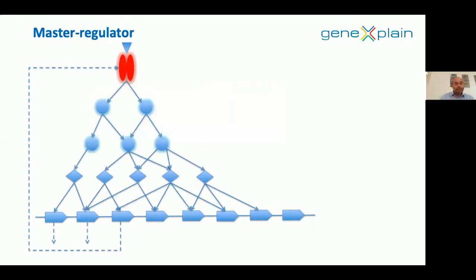After that, when we find these transcription factors which are regulating the activity of our genes, as I said, we start asking whether there is a master regulator which can activate those transcription factors altogether. The signal transduction network, which is stored in our database called TRANSPATH, helps us to find these master regulators. So we are doing a so-called network analysis. By finding shortest paths in this network, we actually get these master regulators.